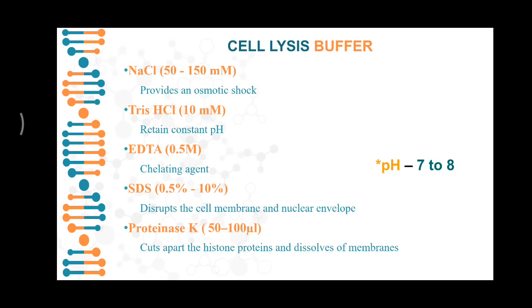This ability prevents DNA and RNA degradation, as the metal-dependent enzymes, which are mostly acting as nucleases, become deactivated.